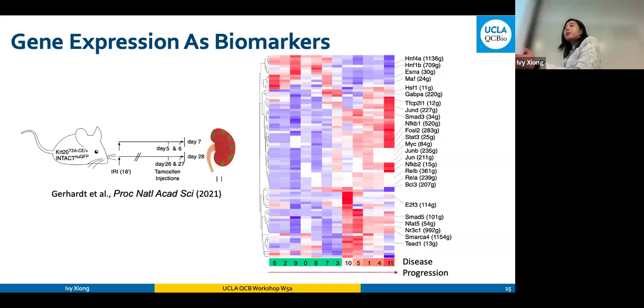It is very popular to use mRNA as a way to find specific biomarkers that can be a proxy to indicate how well the organ, this cell of interest, is doing, and what we can infer about what they're up to. For example, here, a lot of the upregulated genes, the late response to injury, are immune related genes such as the NF-κB and STATs pathways.